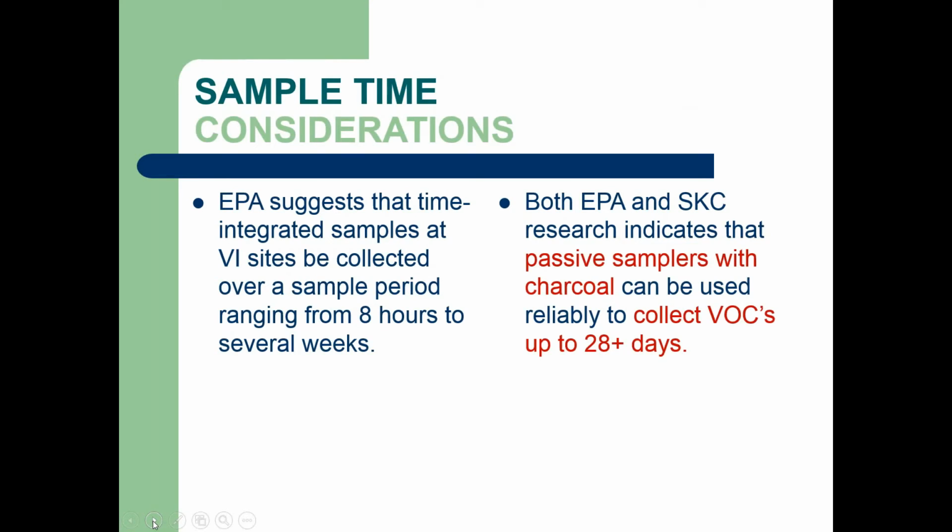In fact, both EPA and SKC research indicates that passive samplers with charcoal can be used for sample times of almost 1 month. This will allow users to better address temporal variability.